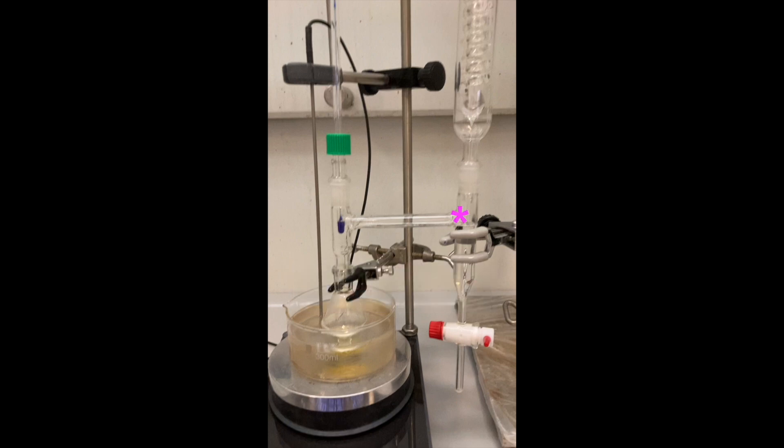A Dean-Stark apparatus is a piece of laboratory glassware used to collect water. It is used in combination with a thermometer to control the temperature and a reflux condenser.